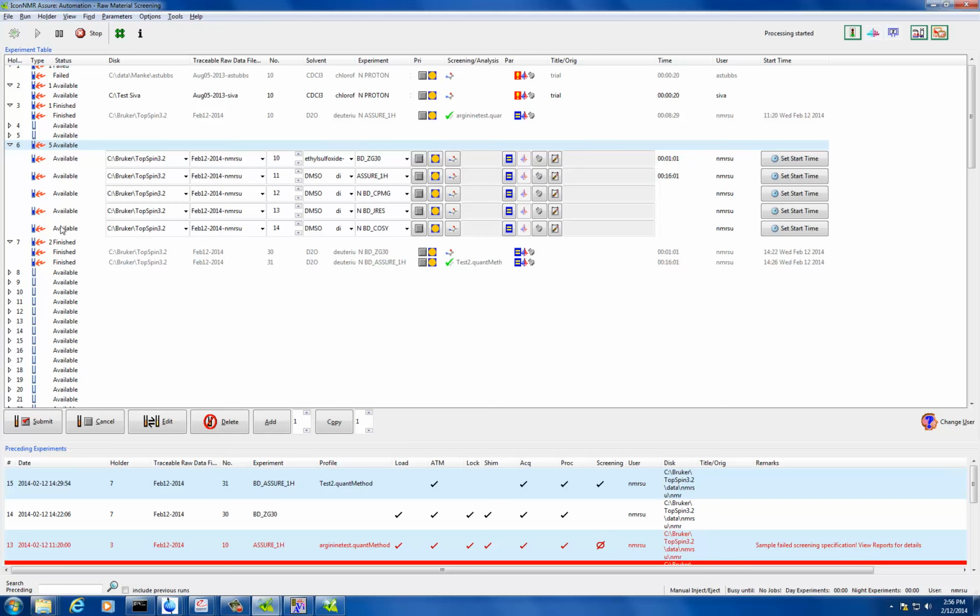So after you run it, then someone else, we're gonna start, we're gonna make a reference file, and then right now you guys don't have anything for reference. I'll go through the procedure. We can use the arginine for now to make it faster, and then maybe once you know what you select, we can make a method for that as well.